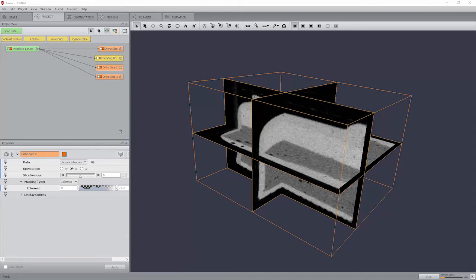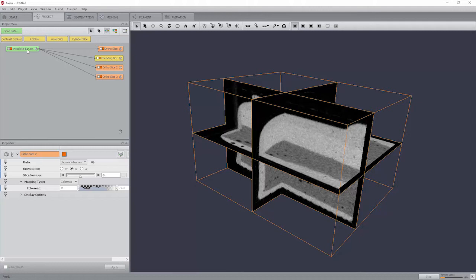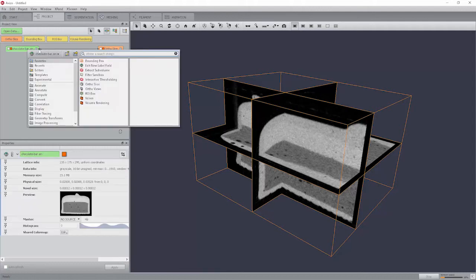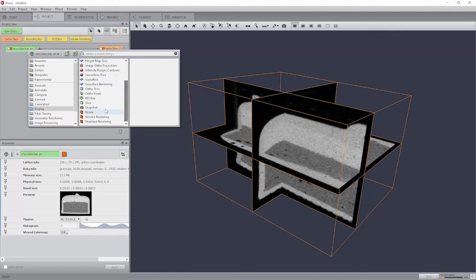In addition to the ortho slice module, which allows you to extract slices orthogonal to the coordinate axis, Avizo also provides a module for slicing in arbitrary orientations. This more general module is called slice. You might want to try it by selecting it from the display submenu of the chocolate bar data pop-up menu.